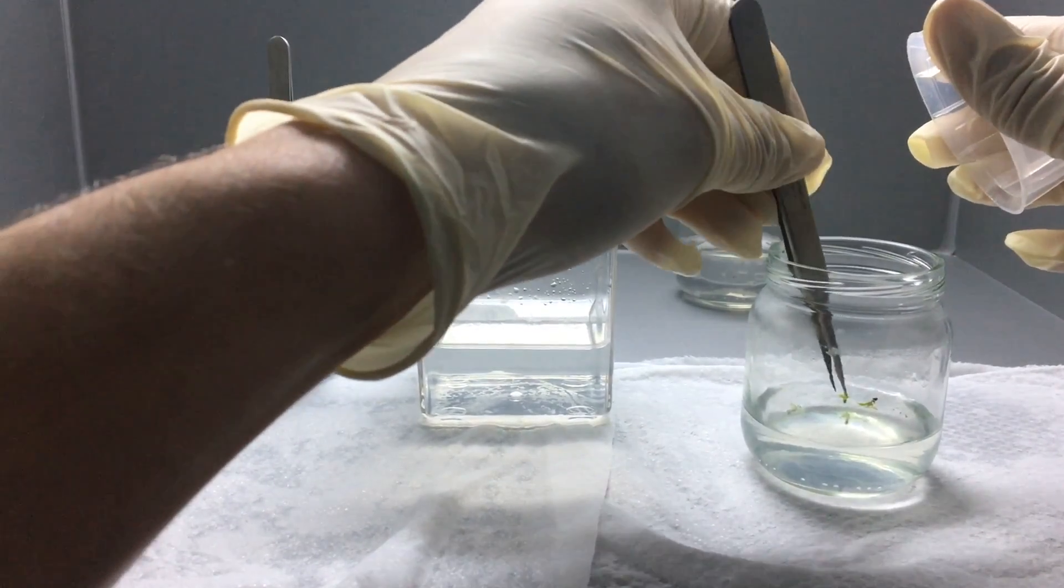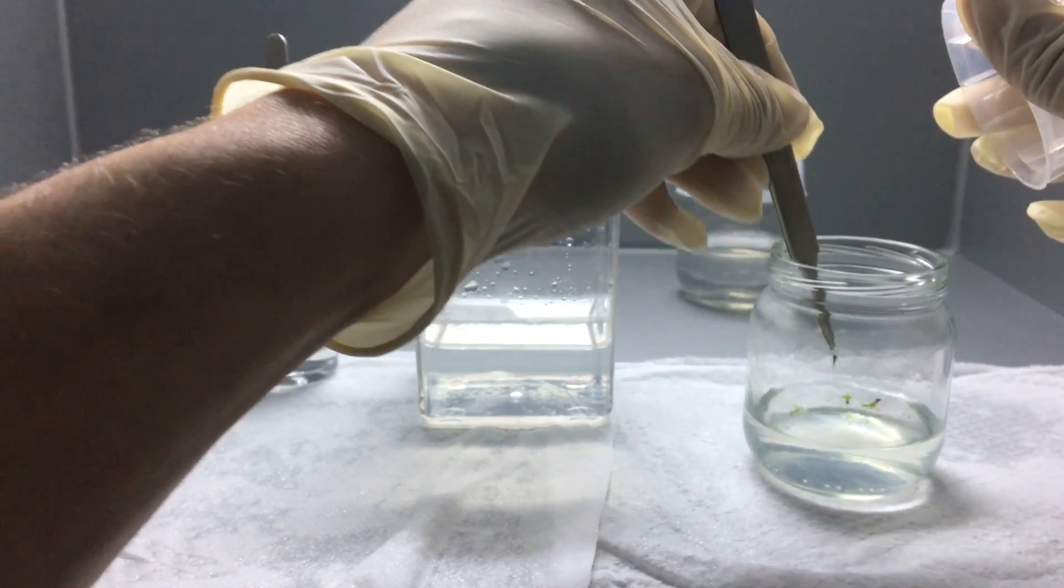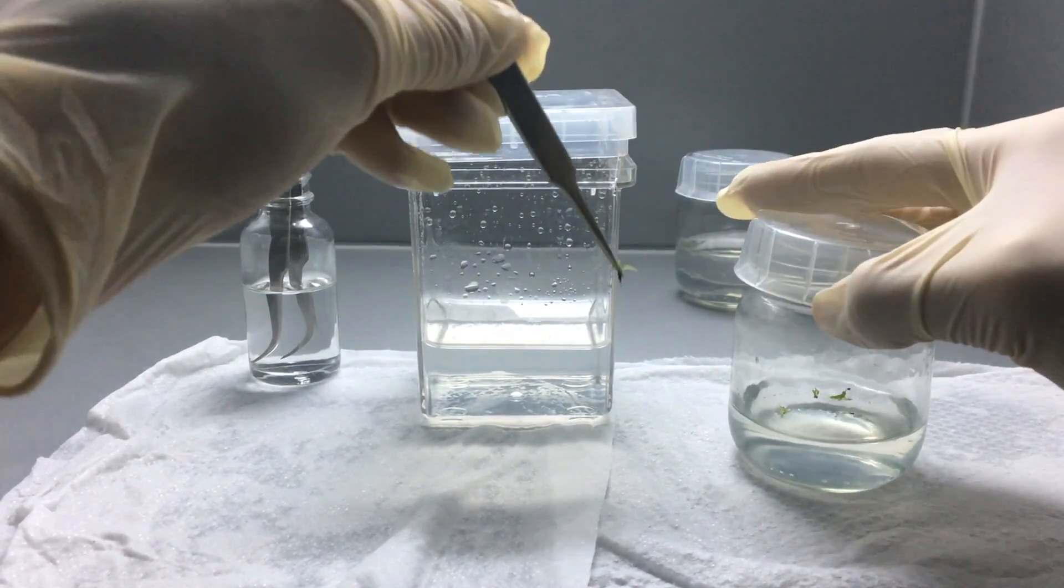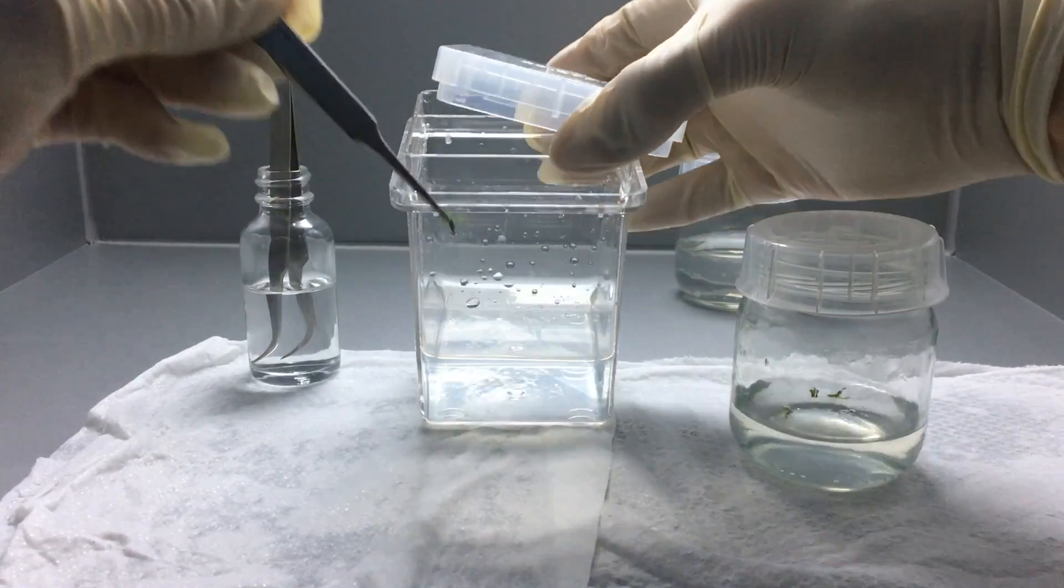So all I did there was flick off the remaining alcohol residue, and now I'm grabbing one of the seedlings. I'm going to cover up that culture again. Even though we're in the laminar flow hood, I like to keep things closed as much as possible.